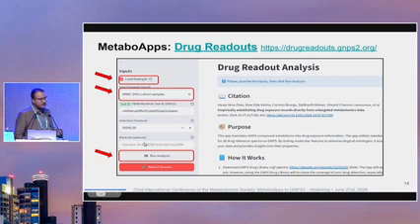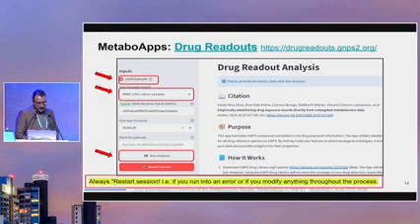So it could be blank, it could be BL, whatever you used for that. You just type the code that is in the name of the sample, and then use these dashes here for all the codes that you're using. And then the information from those samples is already going to be removed, and you'll see how they're going to show up later on the next step.